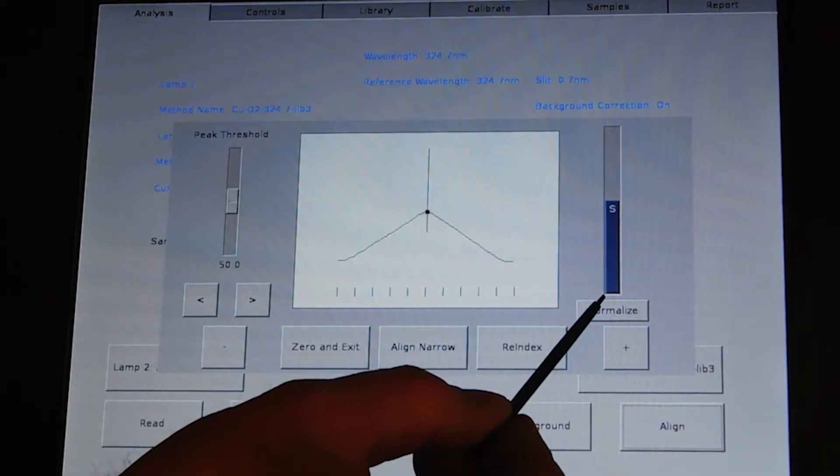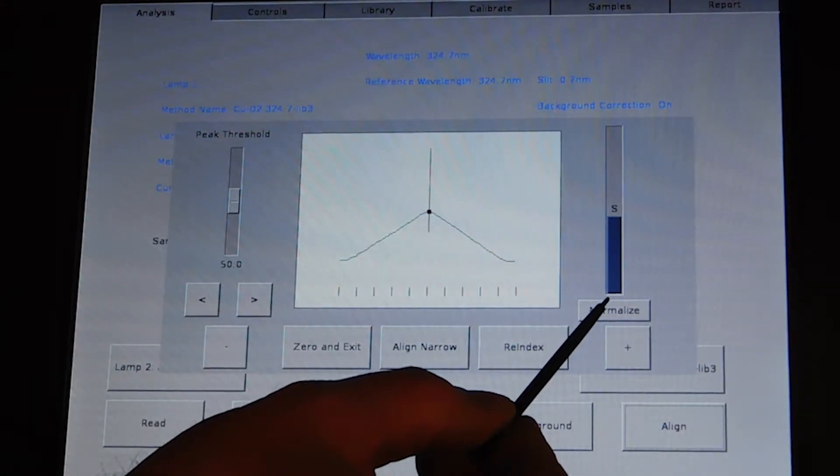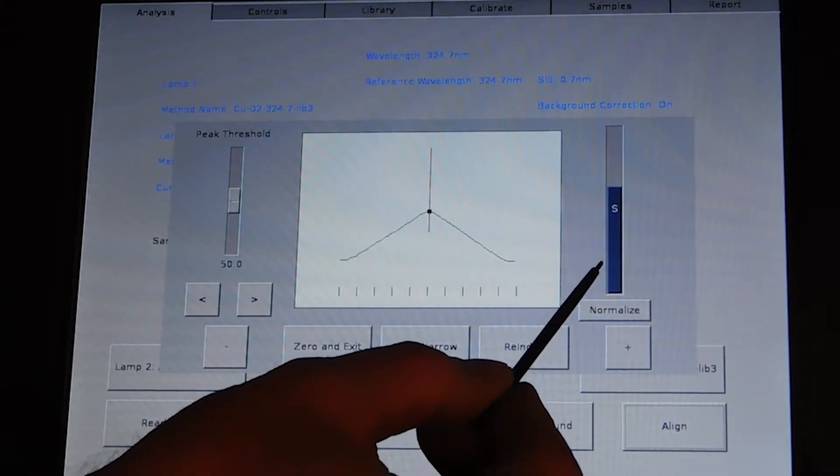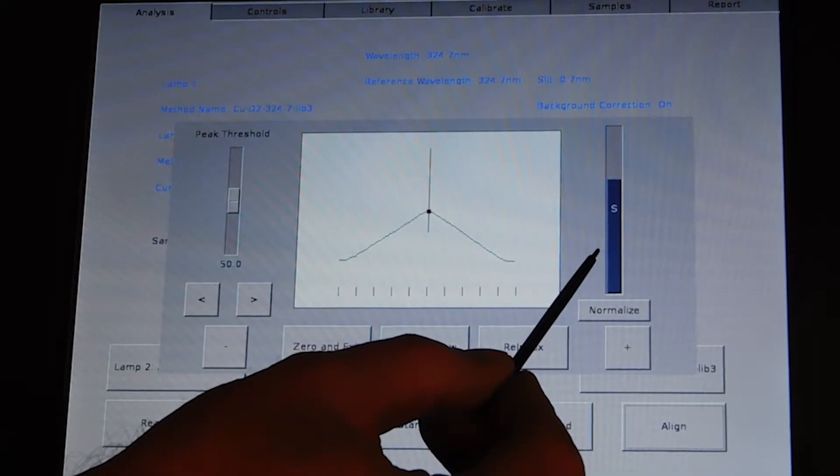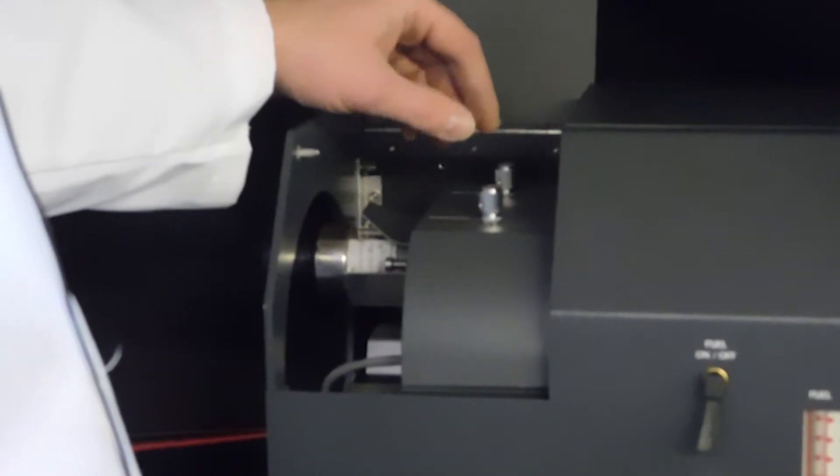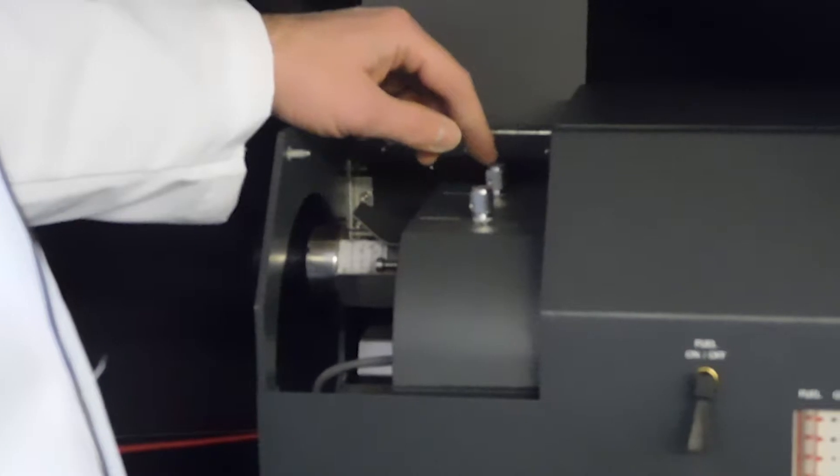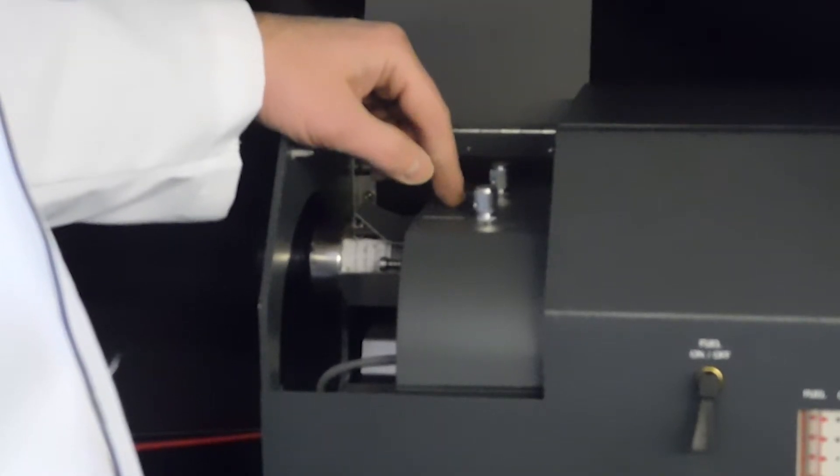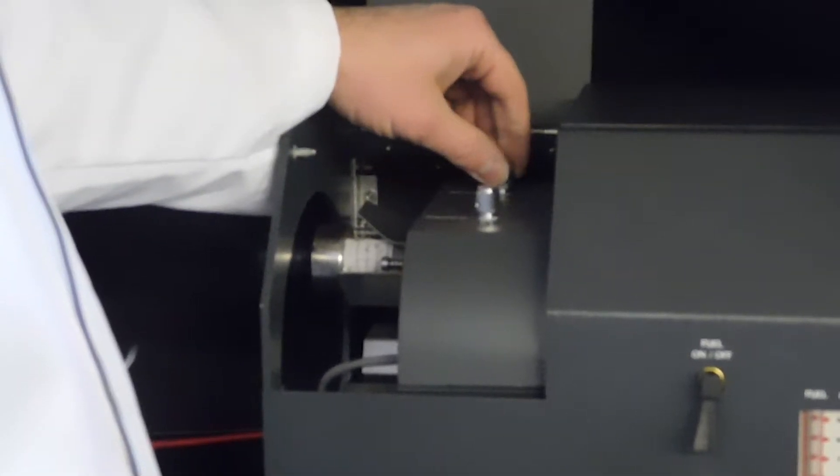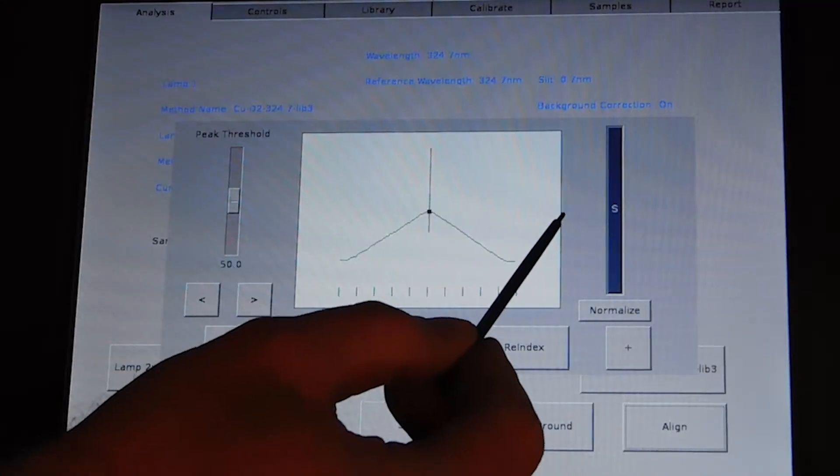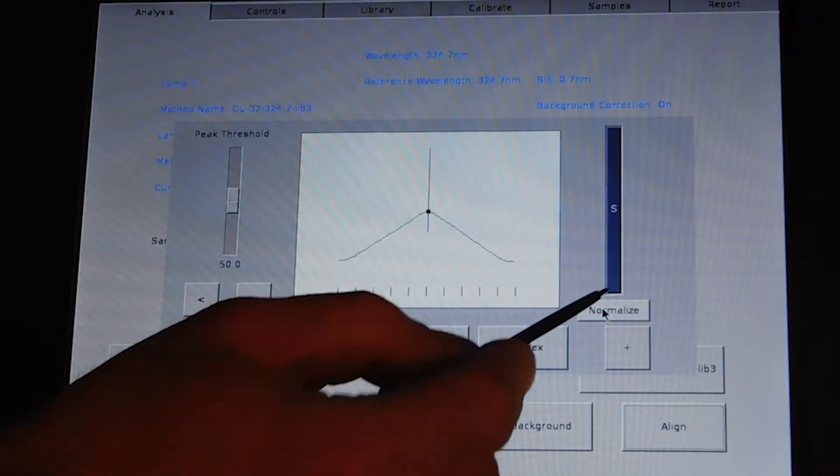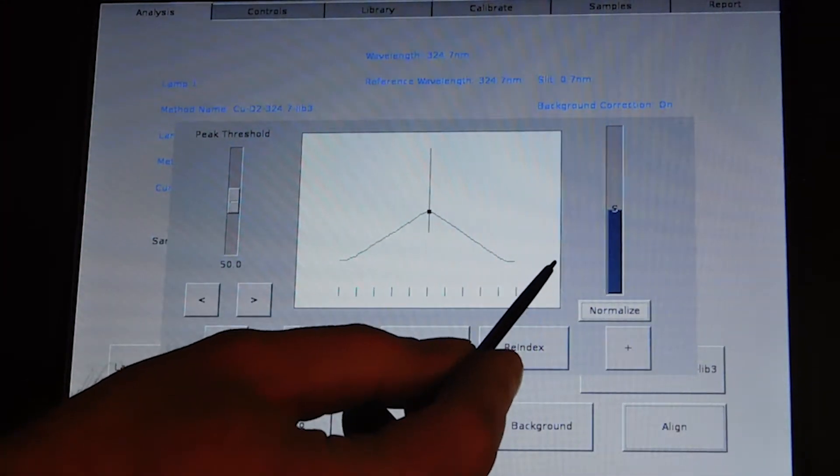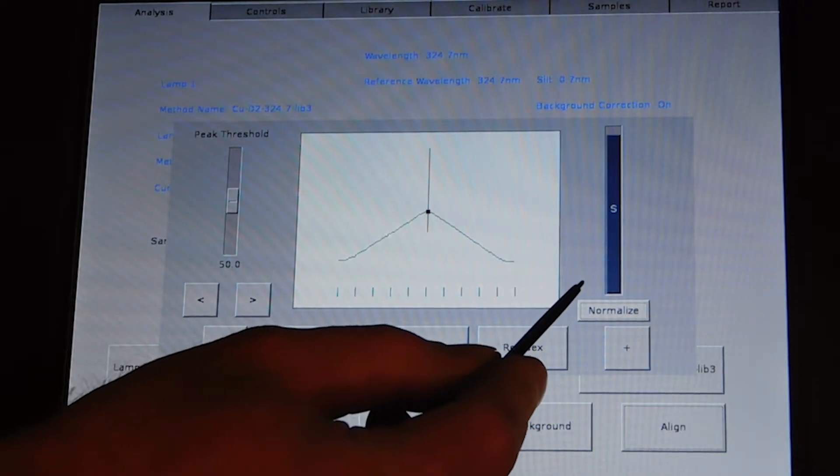By watching the energy graph on the display, you will adjust for the maximum energy by turning the horizontal and vertical lamp adjustment knobs. If it goes off the top of the screen, hit the normalize button to bring it back on the screen.